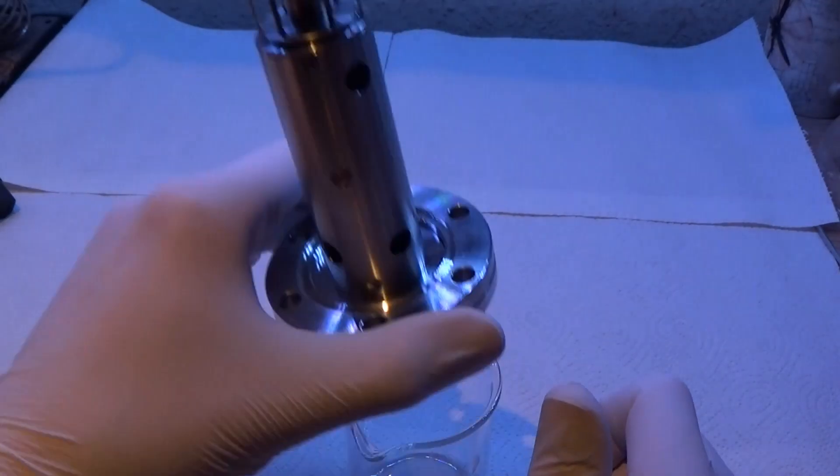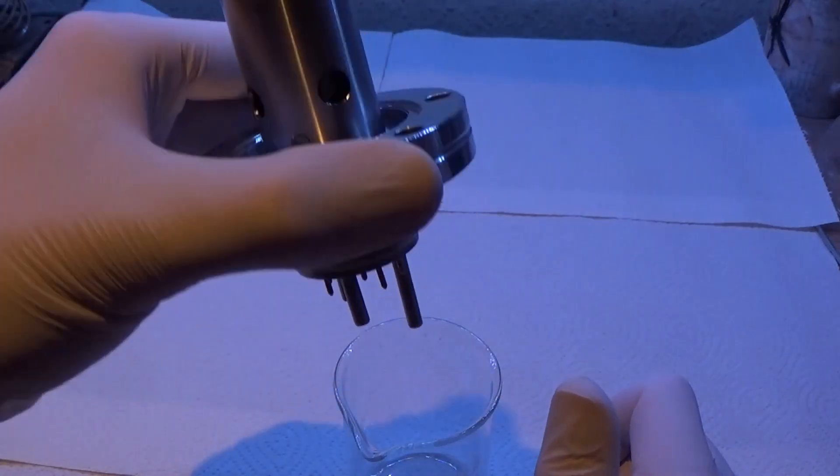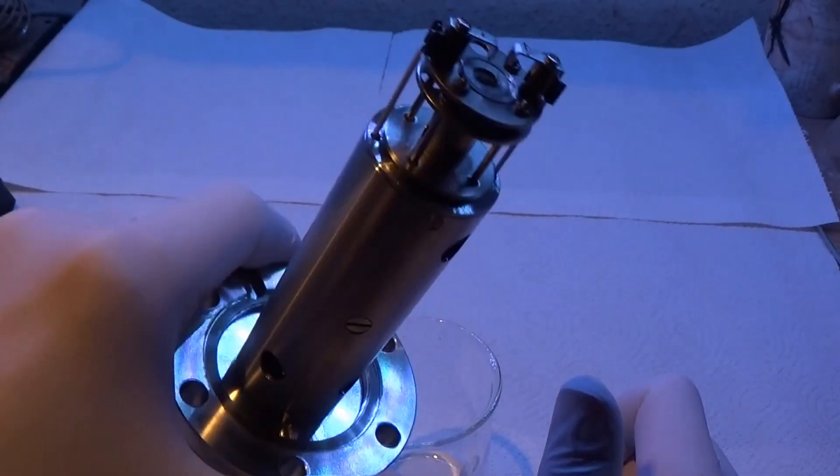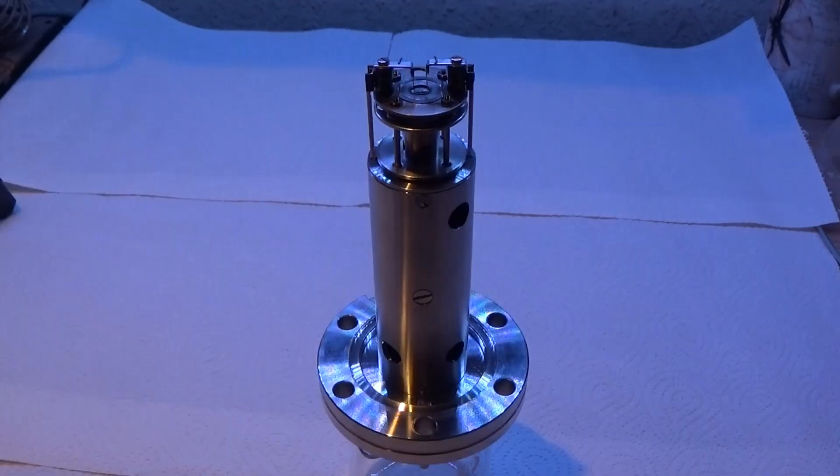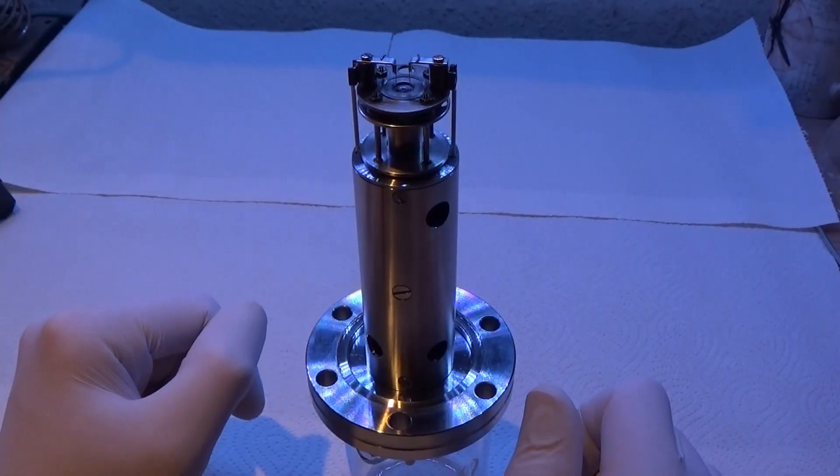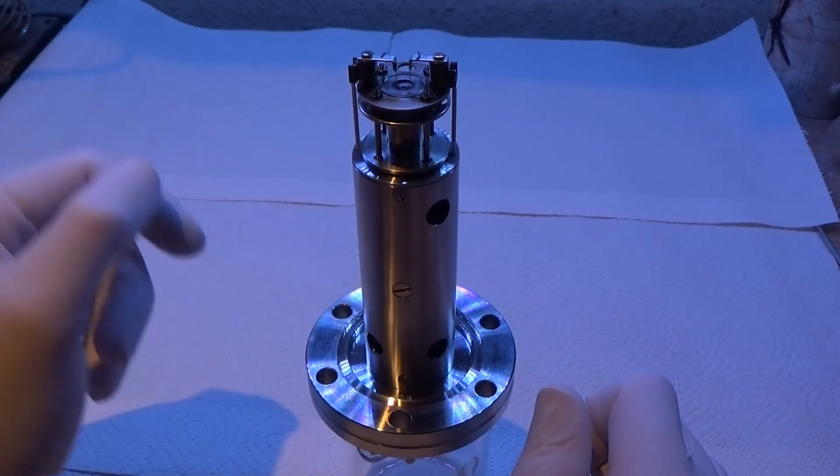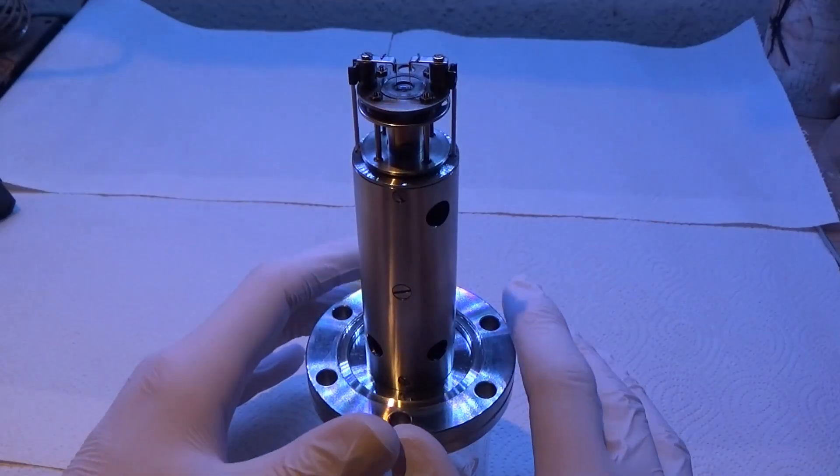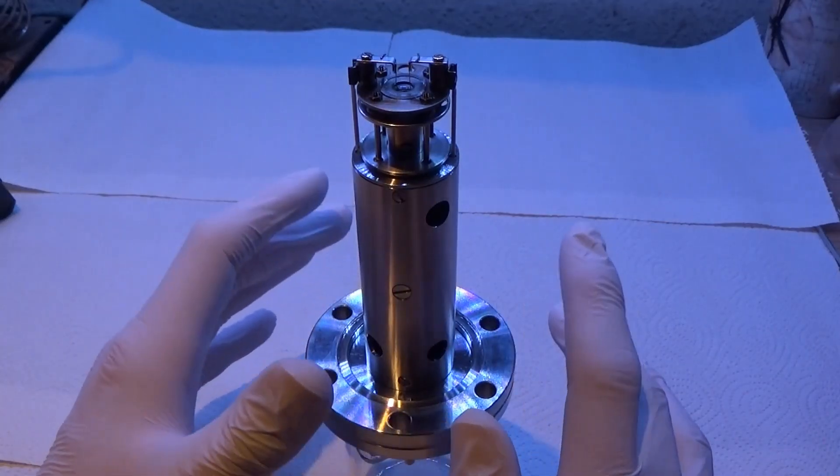The main point is that they're usually pretty simple. They are almost always flange mounted like this, so you can basically plumb this into any high vacuum system you want. And they're usually something that is very similar to what you would find in a GC-MS. Some kind of electron impact ion source, a quadrupole, and a detector.